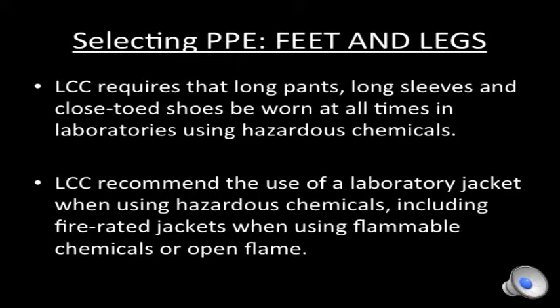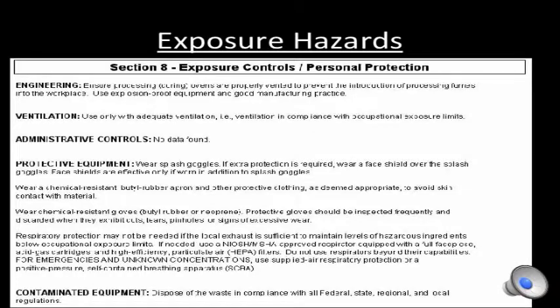When dressing for the lab, remember that LCC requires long pants, long sleeves, and closed-toed shoes to be worn when hazardous chemicals are used. LCC also recommends the use of a laboratory coat or jacket when using hazardous chemicals, including fire-rated jackets when using flammable chemicals or open flame. Knowing what type of hazardous materials you are working with and in what manner you are using them will be the key to successful selection of your PPE.